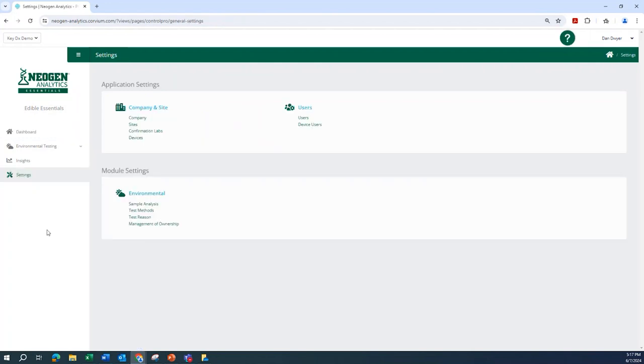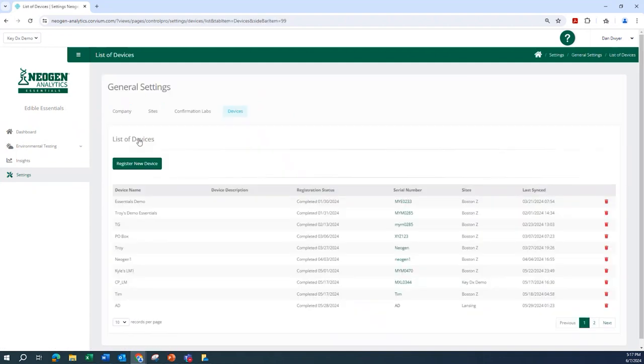When provided, register your device in Neogen Analytics Essentials by navigating to settings from the main left hand side menu. Once there, select devices under company and site. Now select register new device.